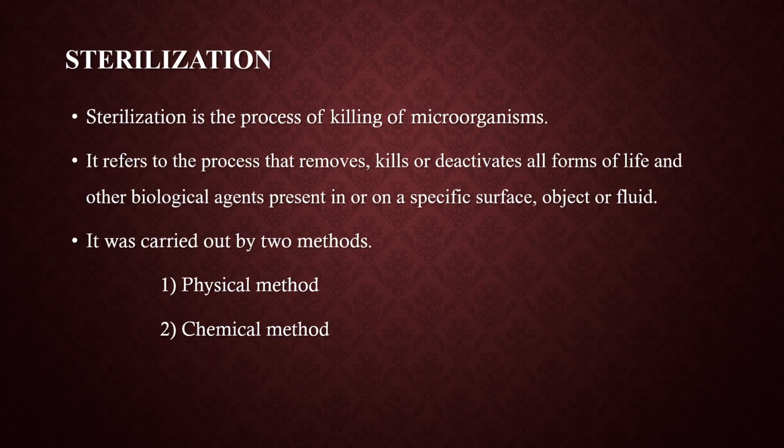First, what is sterilization? Sterilization is the process of killing microorganisms. Sterilization refers to the process that removes, kills, or deactivates all forms of life, particularly microorganisms such as bacteria, fungi, and unicellular eukaryotic organisms, and other biological agents such as spores present in or on a specific surface, object, or on a fluid.